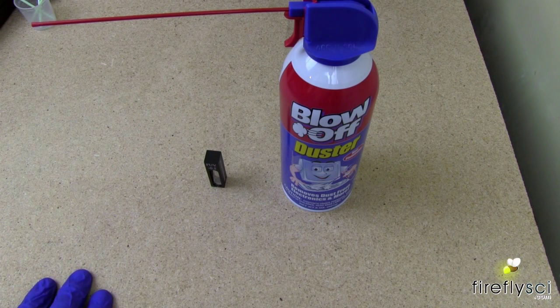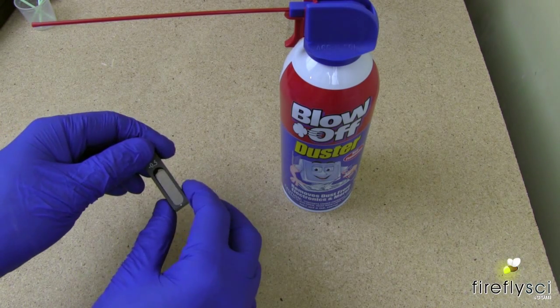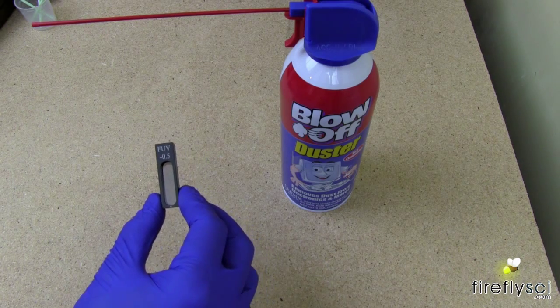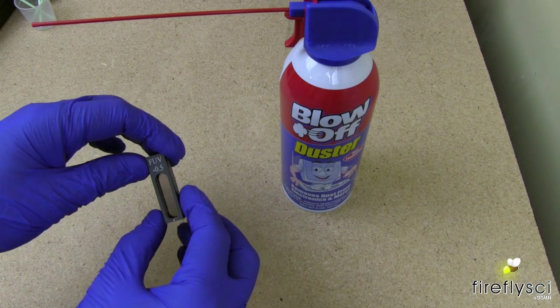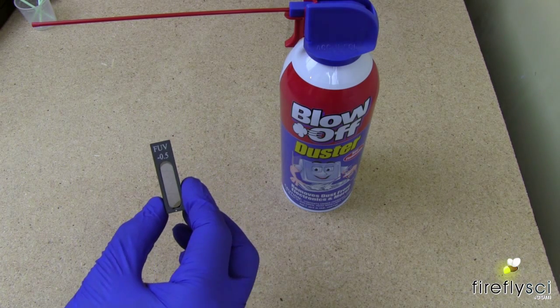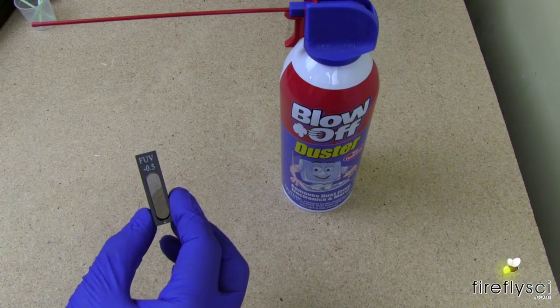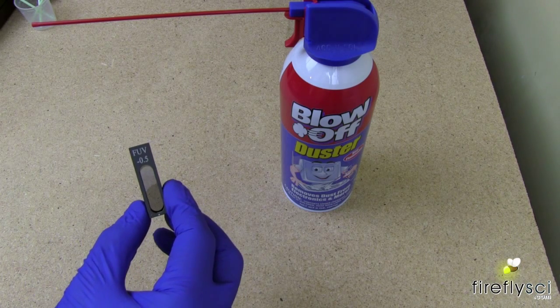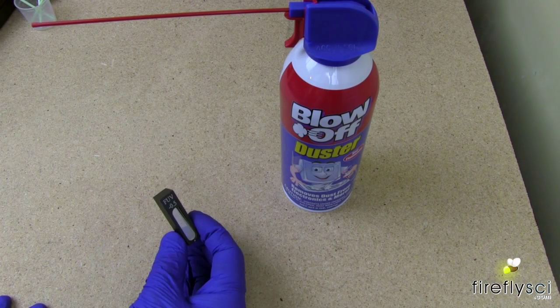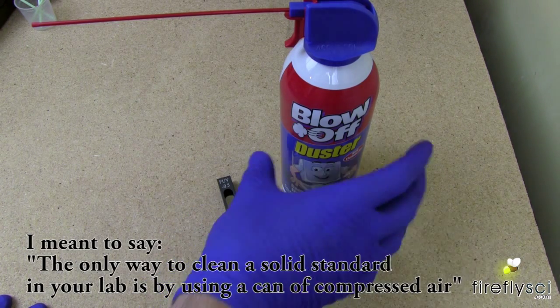Now for cleaning our solid state calibration standards. These standards come in a metal housing and require special care when you clean them. For this one we're going to use my favorite filter, FUV 0.5, from the demonstration. Customers should never attempt to clean a solid state calibration standard in their lab other than the process we're going to show you right now, which is using a can of compressed air — which we have right here.